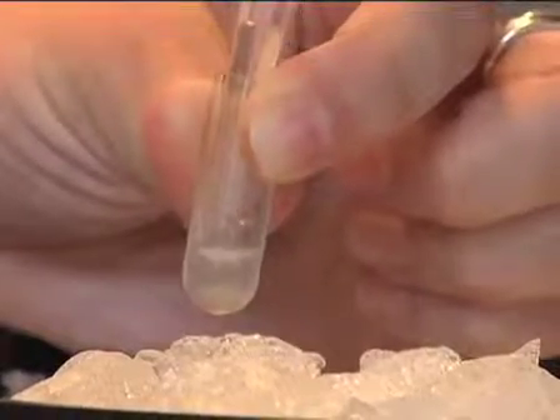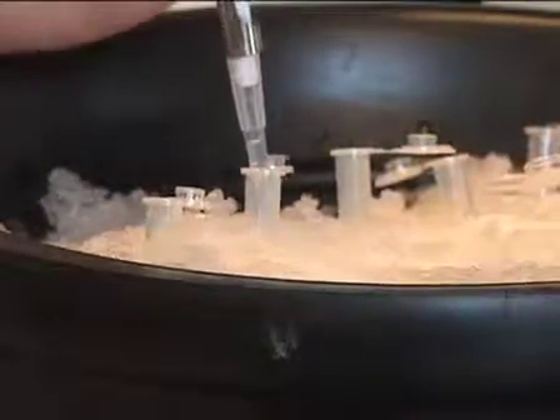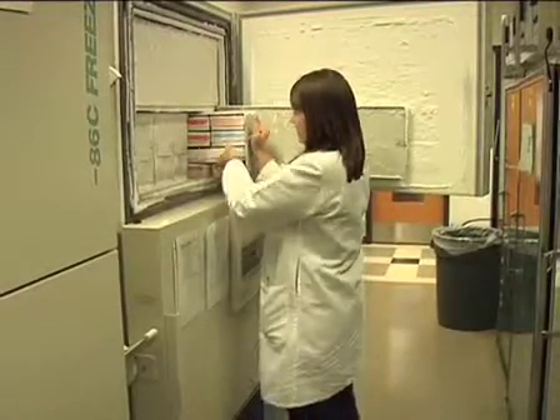After centrifugation, again collect the top soluble fraction and divide it into 100 microliter aliquots. Flash freeze the aliquots in liquid nitrogen and store at minus 80 degrees Celsius until ready for use.